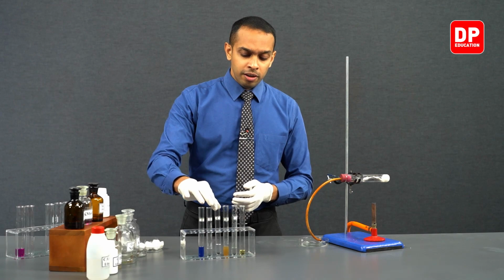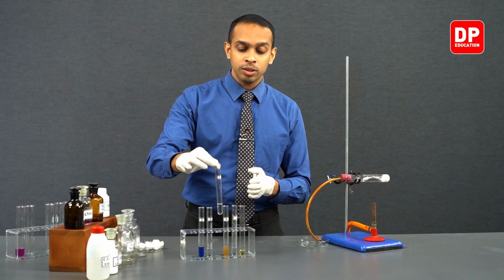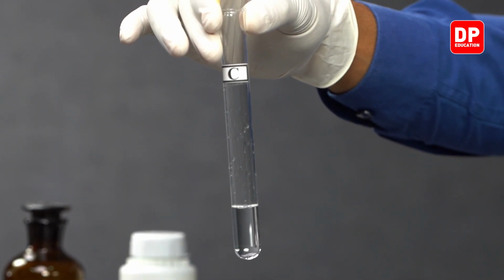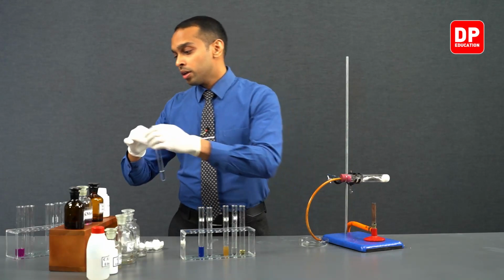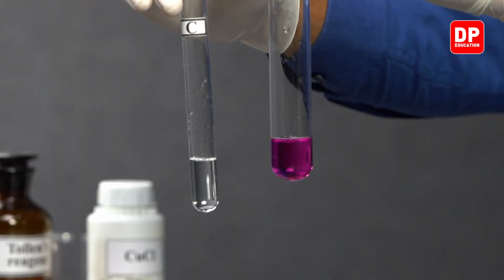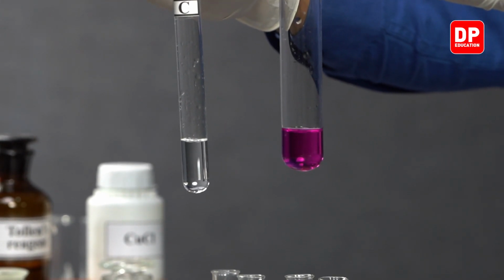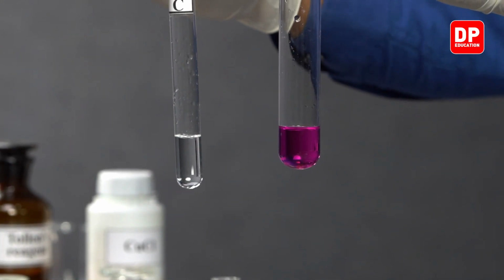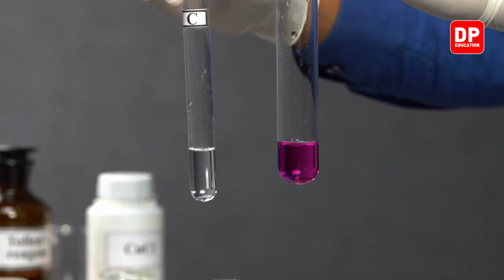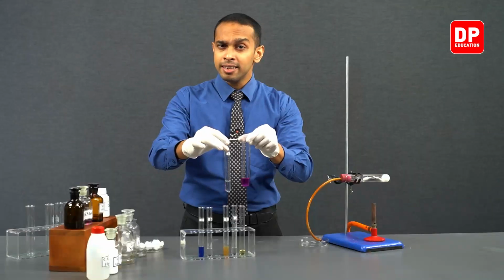So when you are reacting ethene gas with acidified potassium permanganate, we saw the acidified potassium permanganate is purple in color. The purple color of the acidified potassium permanganate completely disappeared when we reacted it with ethene gas.